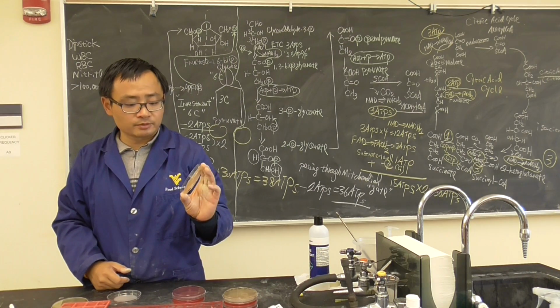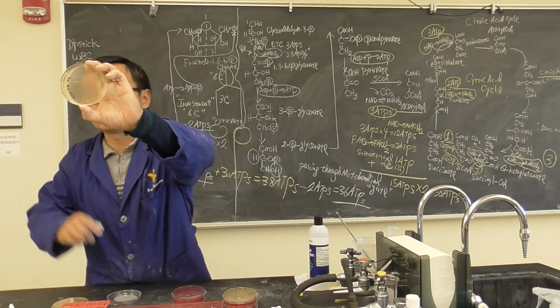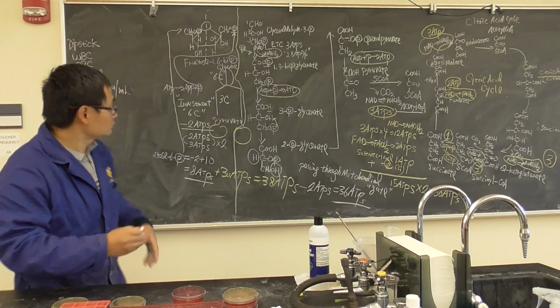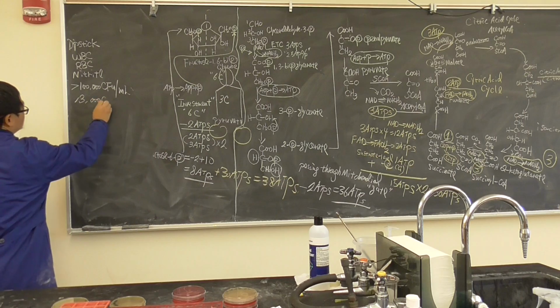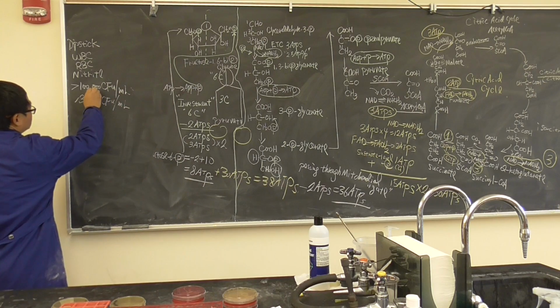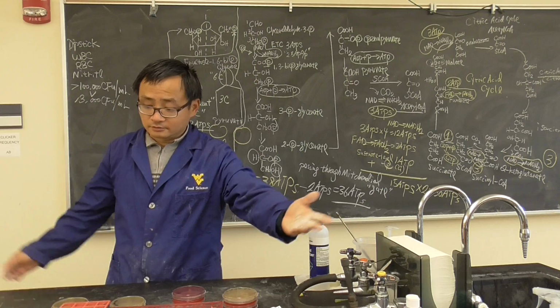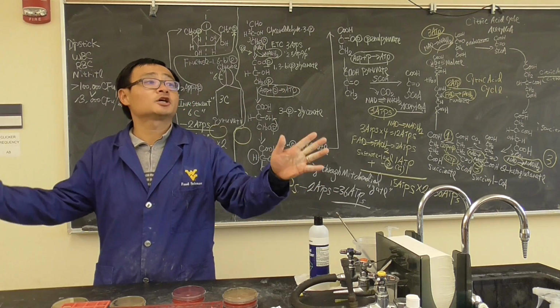Maybe it's a cross contamination. I don't know where it comes from. If you can count it, it's about 1, 2, 3, 4, 5, 6, 7, 8, 9, 10, 11, 12, 13. About 13 colonies there. So same thing as my example. There's 13 colonies. So what happened is this is lower than that. So it's not a UTI yet, but it may be getting there. So if this is a patient, you have to be careful. Is that right?